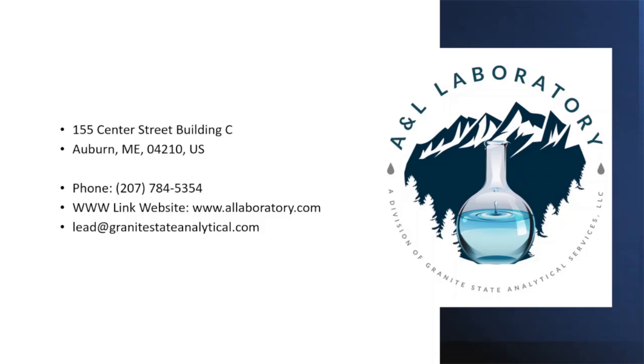It is recommended that you order 2 investigatory sample kits for every fixture with an elevated lead level, and 1 for each supply line bringing water into your building. To order your sample bottles, please contact A&L Labs. Remember, sample bottles are provided at no cost to you.